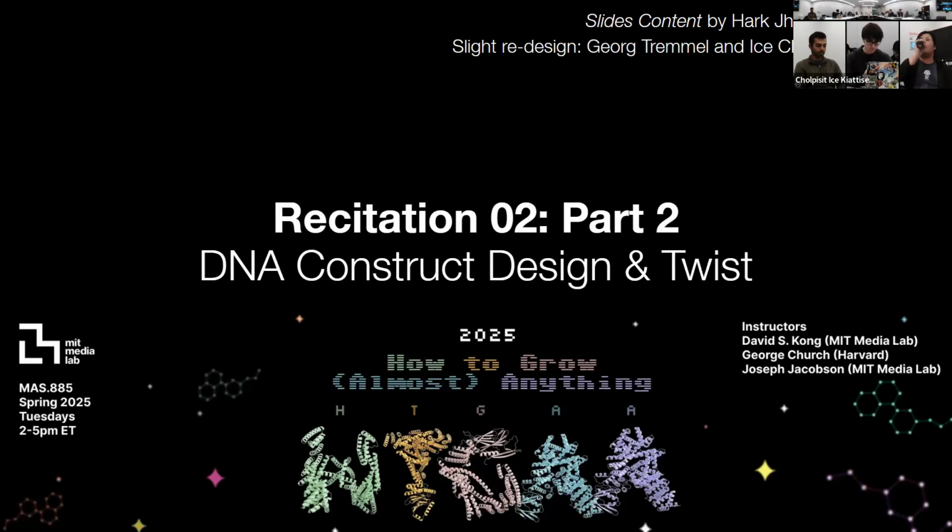And for the purpose of tomorrow's lab, for in-person students, it's going to be focused on using a combination of different restriction enzymes to demonstrate that you're able to cut this DNA and get the size that you want. It's not going to have any downstream applications, for example PCR, assembly and so forth, that use the products of this restriction digest. We're not going to do any of that for the sake of this lab, just to get you guys in the lab. All right, let's move on from this part briefly. If you have any questions, you have the slides and you can reach out to us.